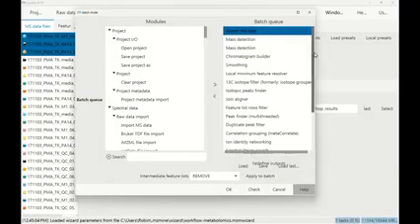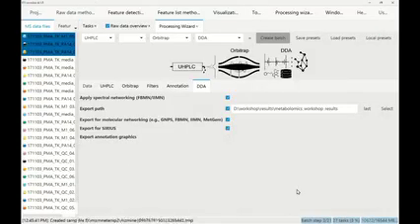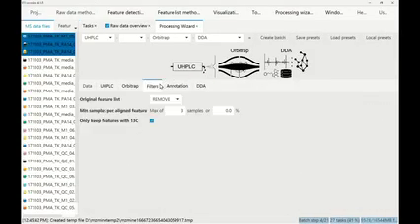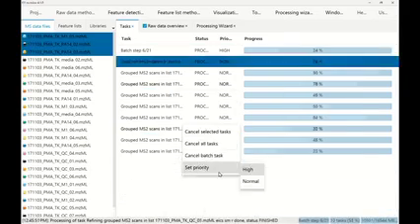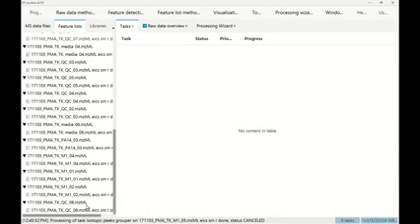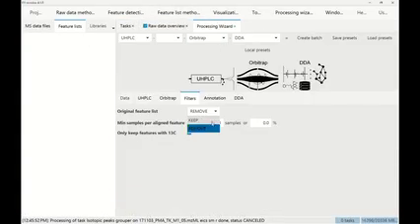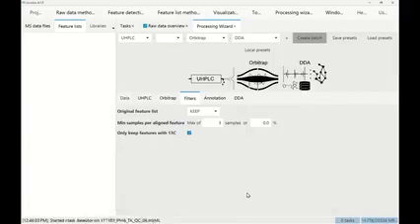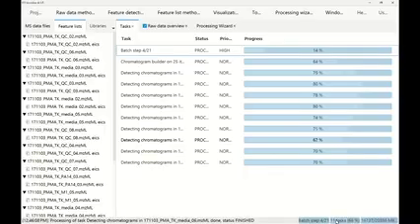It looks quite similar still. We have this batch queue, and from here, I'm not going to describe it much. We're just going to click OK and run all the steps. So, and I actually forgot something, so I'm going to... You don't have to stop it. I want to do something a little bit different, but just to show you something. Okay, and run.